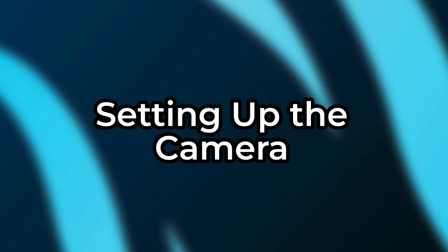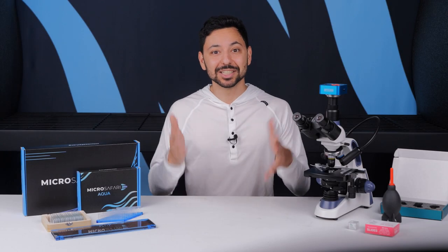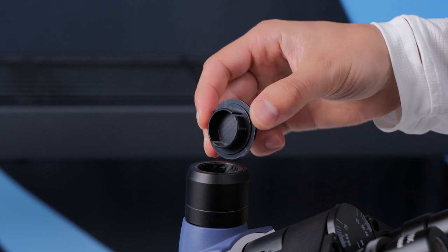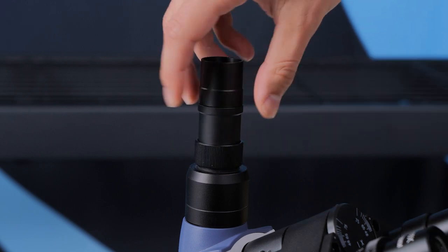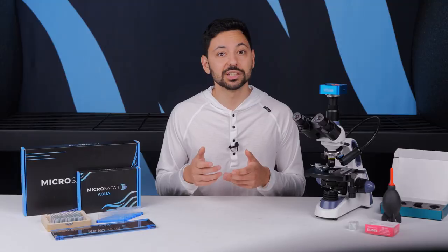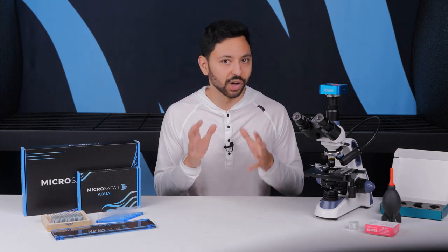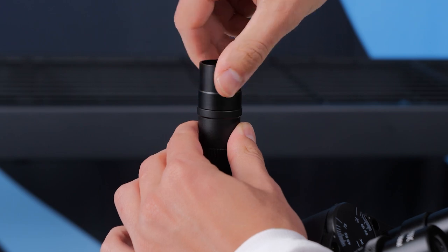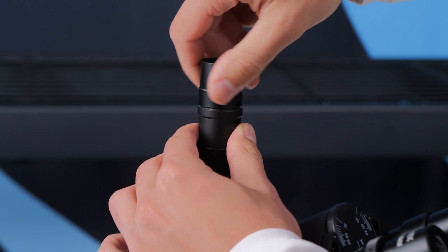Setting up the camera. Great news! It's pretty straightforward to set up the camera. You'll want to remove the trinocular port cover and screw on the C-mount adapter into the port. Make sure you keep this cover because you'll want to replace it whenever you don't have the camera attached. You don't want to leave any open ports on your microscope. The C-mount adapter has an eyepiece adapter screwed onto it already so you'll want to remove that.